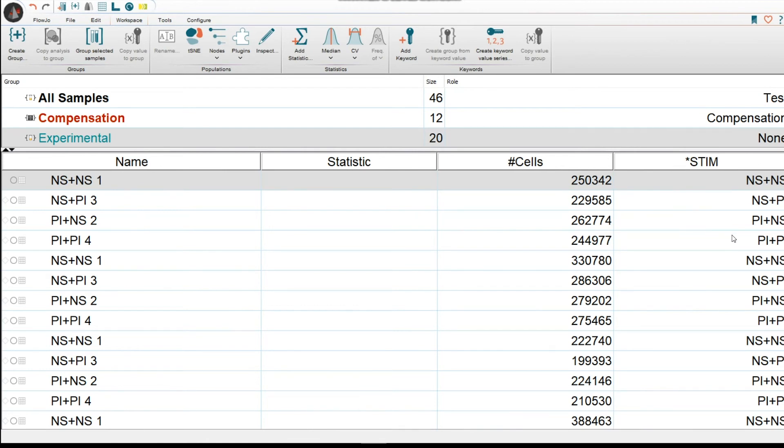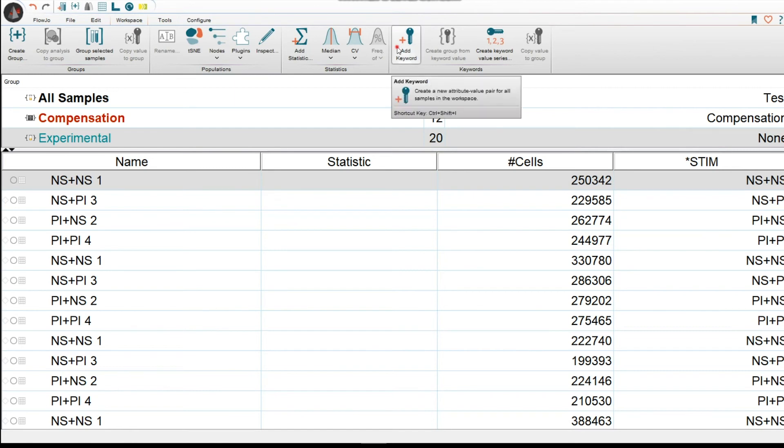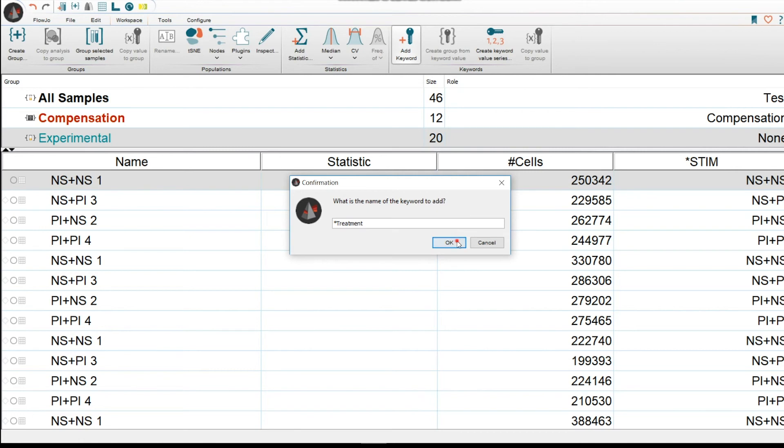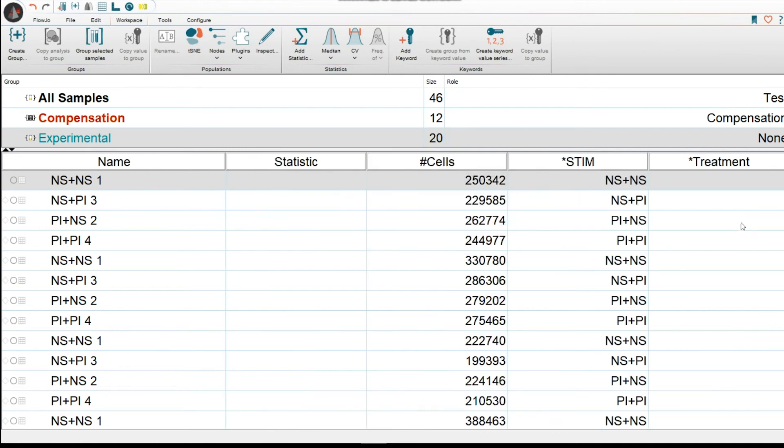What about if we wanted to add our own custom keywords at the time of analysis? Well, this is quite simple. You click on Workspace and then Add Keyword. Here, we would just type in whatever it is that we want to type in. For instance, I'm going to just go ahead and put in Treatment. And I'm going to click OK. And it's going to show up.